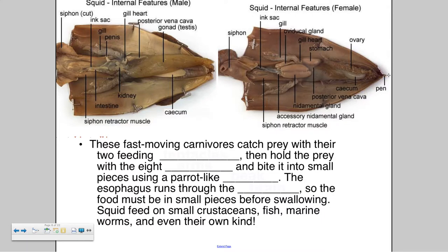It's on the other side because this is the stomach. We opened it up from its stomach. The inner shell's on the other side. It's the pen. Also, with that being said, just so you know, the stomach here, their brain is underneath, so their food passes through their brain. So it's called brain food. Makai.